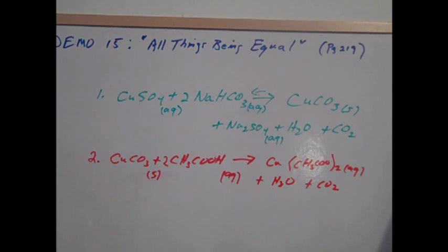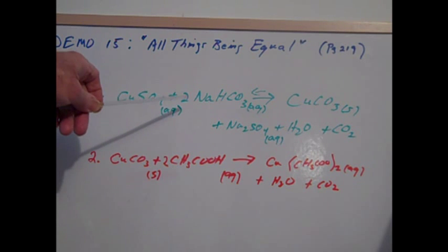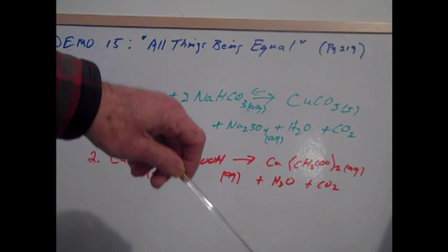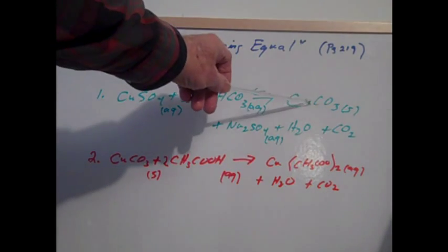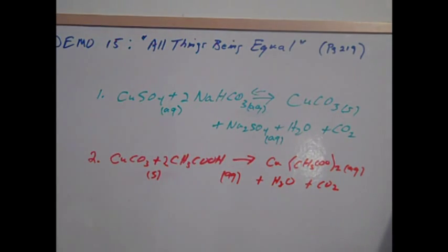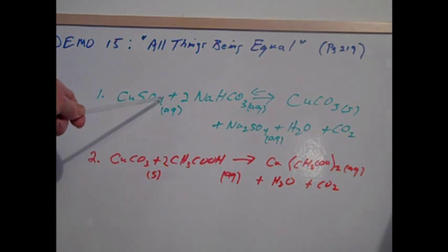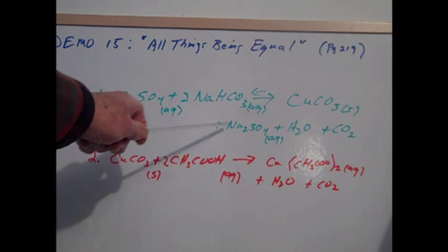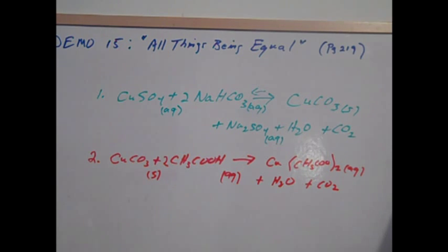In a first reaction, we're going to look at copper sulfate, which is dissolved in the solution, reacting with sodium bicarbonate, baking soda, which is also in solution form, forming a solid precipitate of copper carbonate. Now, not all of the copper will be in the form of copper carbonate. Some will still be dissolved, and you'll be able to see by its color, in the copper sulfate form. The rest of the reaction is that sodium sulfate, which also dissolves, is formed, along with water and carbon dioxide.